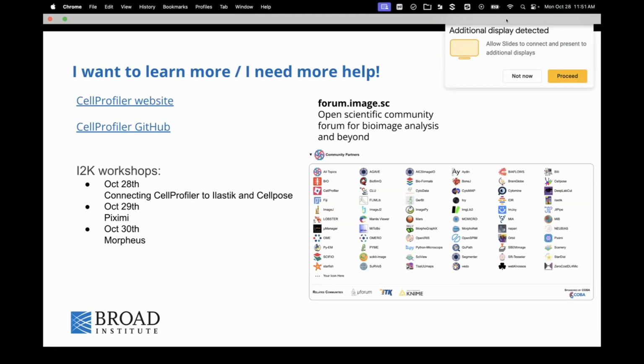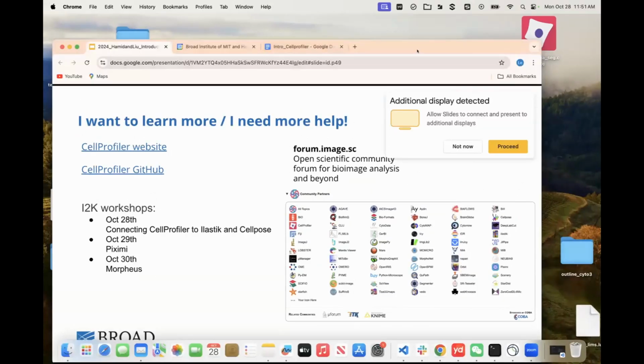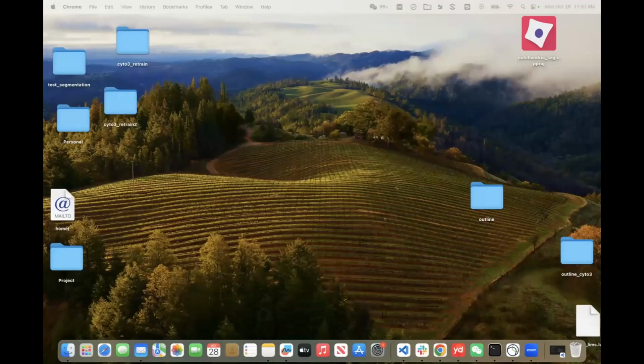There's also a follow-up question: how can we perform QC for images with CellProfiler? Sorry, for me or Le? I just noticed there's another question in the chat if Le wants to take it as we join the breakout room. Sheta, can you address that question?